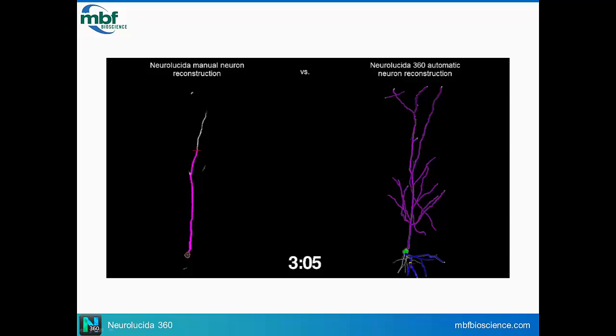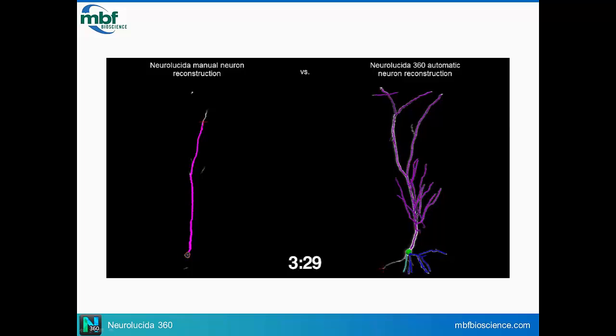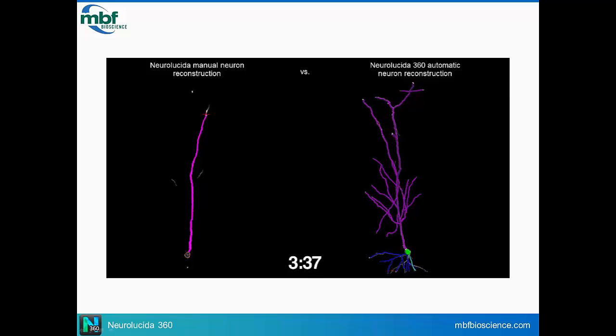No, I mean, I think there's over 100 analyses you can do with Neurolucida. Is that what you mentioned the other day? There's tons. Well, the other thing, actually, you know what? You reconstruct your neurons in Neurolucida live and then take your Sholl analysis over to the confocal and say, okay, now I want to image at these particular locations. Yes. I think that ability to mix modalities between live and imaging and quantification is something that is impossible with ImageJ or Neuron Studio because they don't control microscopes.